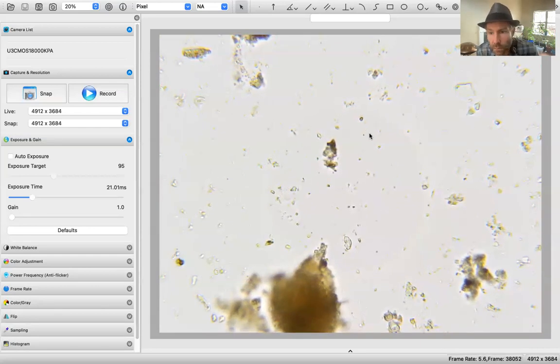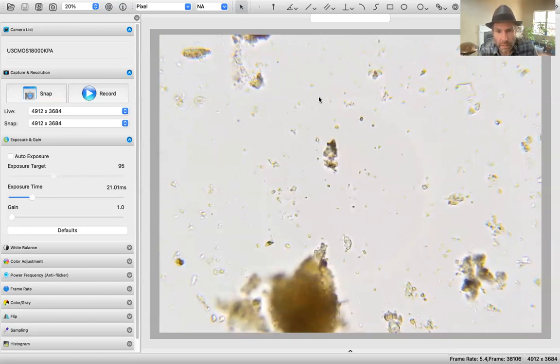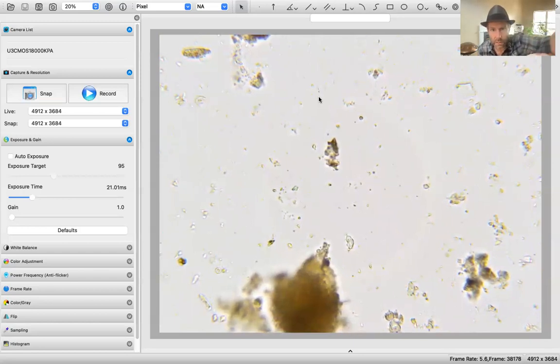No, it's a tough one. Looks like to be actino right there, but it's got a bend in it. But it's not a bend like a lactobacillus bend. It's not a curve. It's more of a 90-degree. So I think that's actino that grew through something like a rock and had a bend to it.